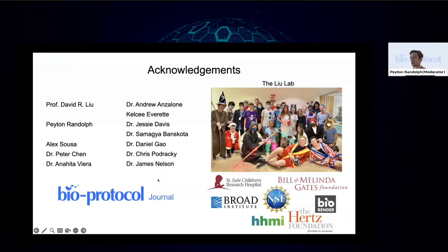Awesome. Yeah, I guess we can just get right into it. The questions have been rolling throughout the whole webinar. Looking through them, we have a couple of questions. I'll start off with this because they all tie into the same vein: how does prime editing efficiency using other variants of Cas9, PAM variants, and other orthologs compare with regular SpCas9?